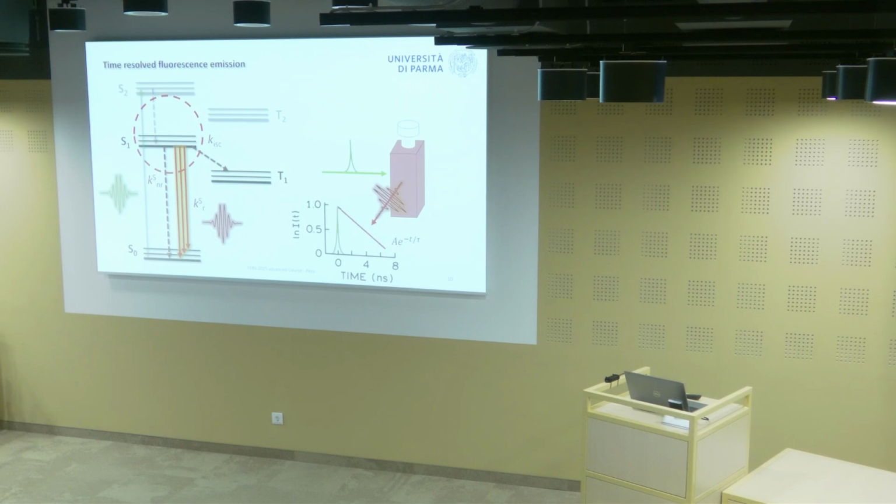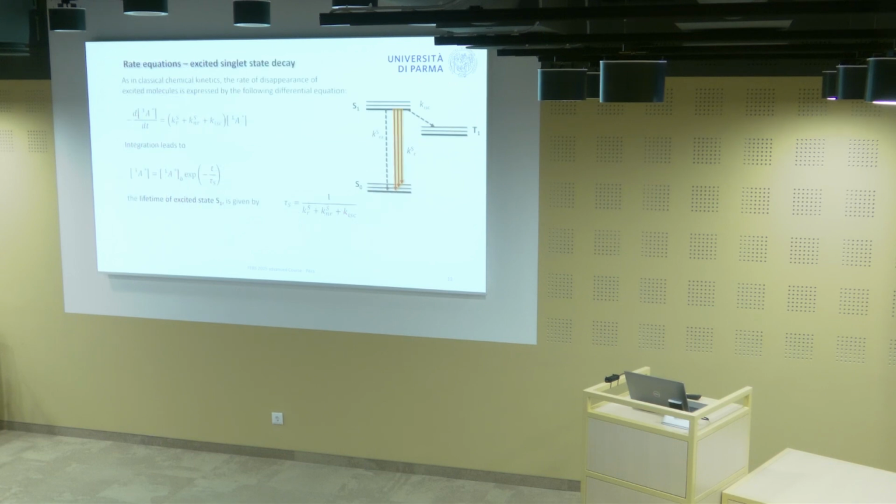It looks like an exponential, though it may not be one. It looks like a straight line because here it's plotted in a semi-log drawing.